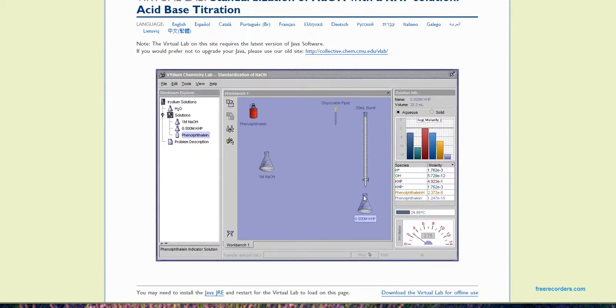If you were doing this in a lab, the pink color would appear and it would disappear, and then you would add a little more and it would appear, and then it would disappear as it gets mixed into the solution. It disappears until you finally add enough of the sodium hydroxide that it stays. So we don't have the appear-disappear problem here. Here we're just adding small amounts until we see a color change. So if you want to see that appear-disappear, Google it. There are some good YouTube videos.